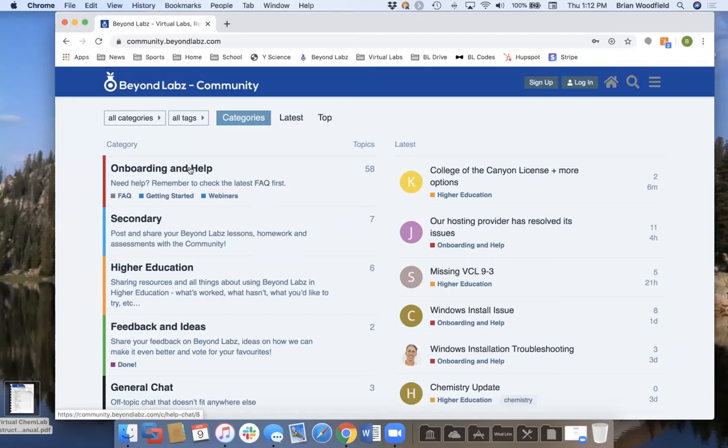Okay. Well, this almost looks like a wiki, because I'm going to use this in order to learn things myself, especially on those reactions and stuff like that. I can teach myself organic chemistry on this.